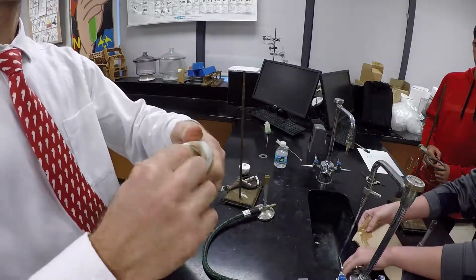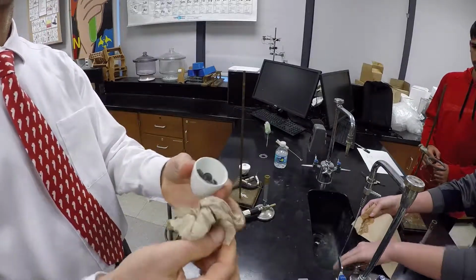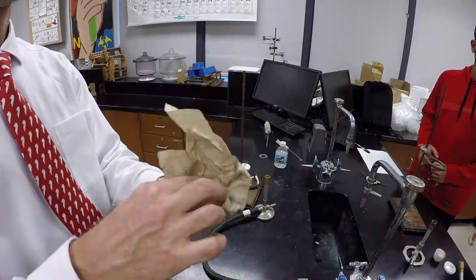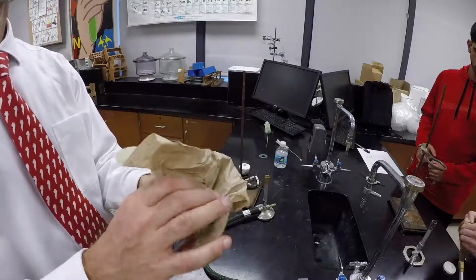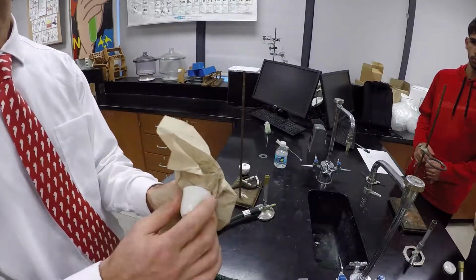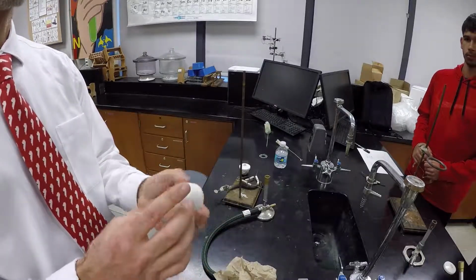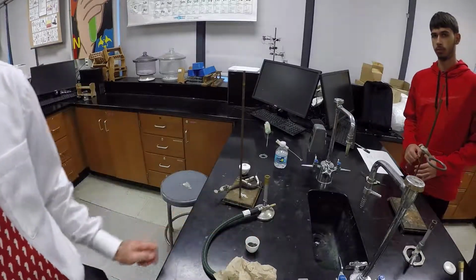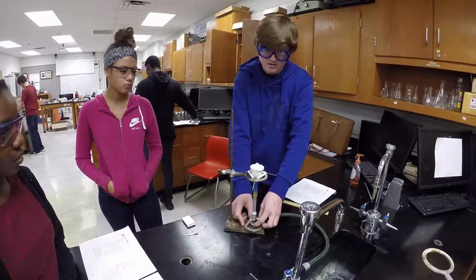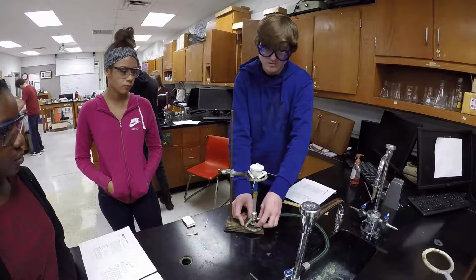In the crucible, we're just going to take a wet paper towel, wipe it out, another paper towel, dry it. Alright, just dry it this way. But we don't want to put water on it because the water is really cold, and the cold and the hot cause these things to break real easily. So that's why I don't recommend putting it in water. Try and get the fire to go down a little bit. Can I get that cone?